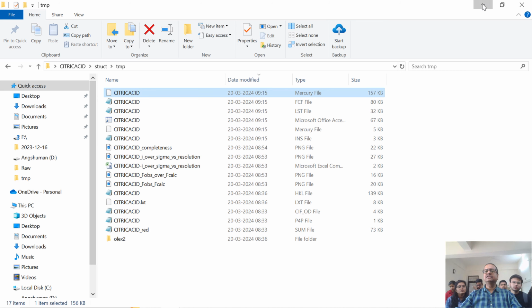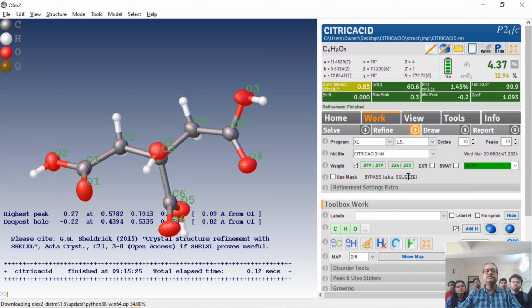In the earlier case, that was different, which I think I did not show you. We can again go back and do that.